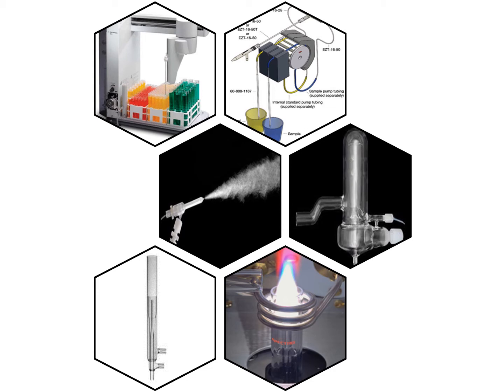A microwave has microwave radiation, and that basically vibrates water molecules, okay, and heats them up, because that's all heat is, vibration. So all this is doing is basically shaking the argon atoms, so they get very, very hot and they ionize, and that's what creates the heat that causes the plasma that allows us to ionize our samples.